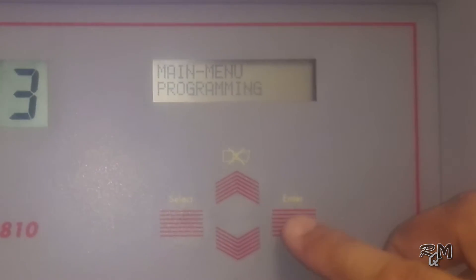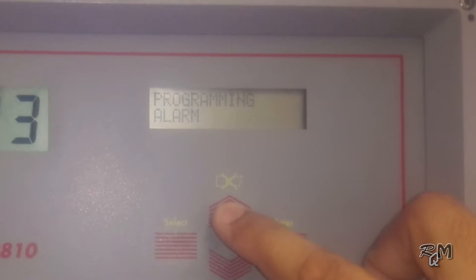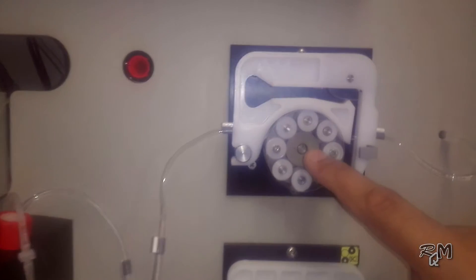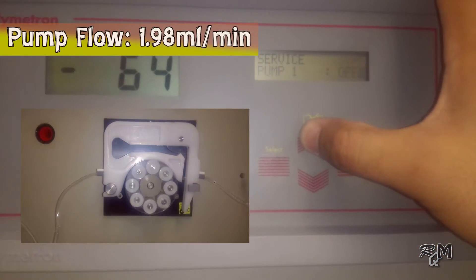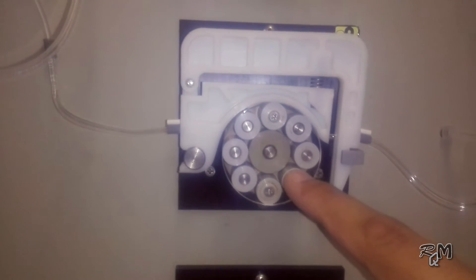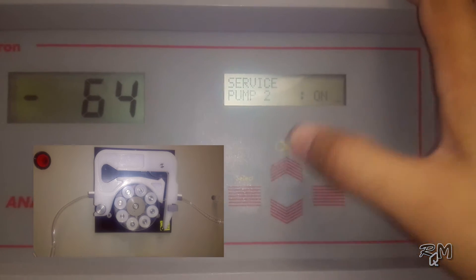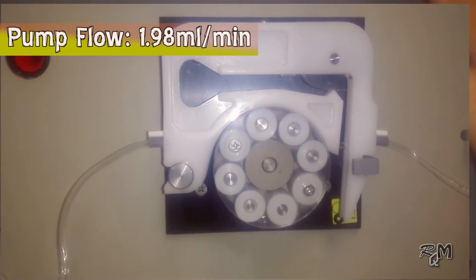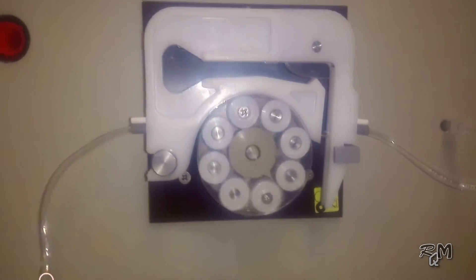To switch on the pumps we will use the service menu. Select the programming menu, press and hold the Enter key until the measurement display appears, then go to service menu by pressing the up or down key. Go to pump 1, which is related to titration — you will see it is in off condition. Press up or down key to switch on the pump, then press Enter to move to the next step which is pump 2, related to the conditioner pump — you will see it is also in off condition. Press up or down key to switch on the pump. After that, ensure there is proper flow coming out from the injection and turn off the pumps. Ensure there is no bubble in the flow.